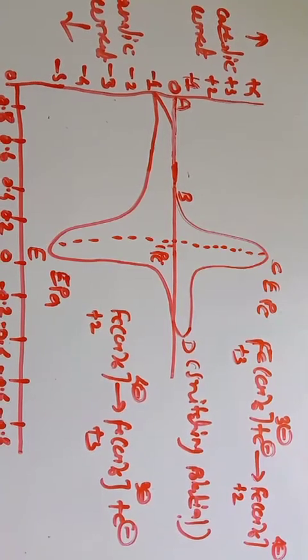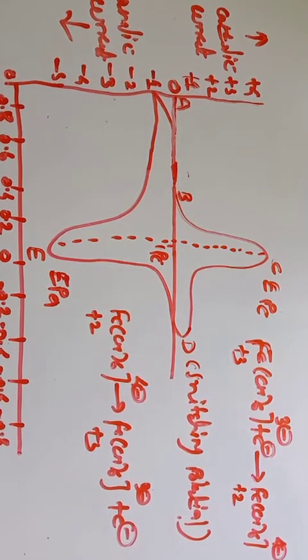Good morning, dear student. In this lecture, we discuss the cyclic voltammogram for the potassium ferrocyanide redox couple. In an earlier lecture, we already discussed the theoretical part regarding cyclic voltammetry. In this lecture, we discuss how this cyclic voltammogram is obtained for this potassium ferricyanide redox couple.